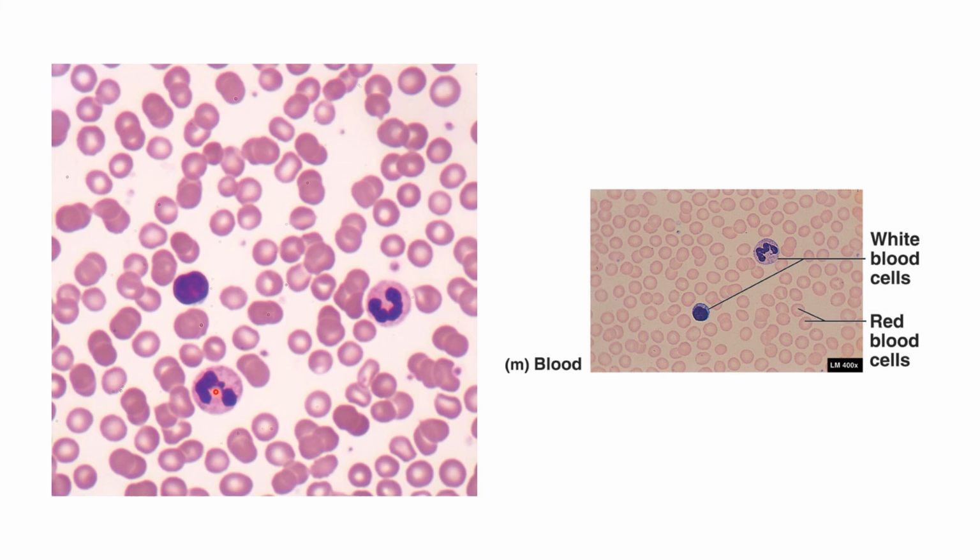The bigger cells we see here, okay, and these are much larger, these are a type of white blood cell. And these particular white blood cells have an unusual shaped nucleus. And notice that the nucleus in each one is a little bit different. That's all right. These are cells that phagocytize or eat other things that should not be present. So these are white blood cells.